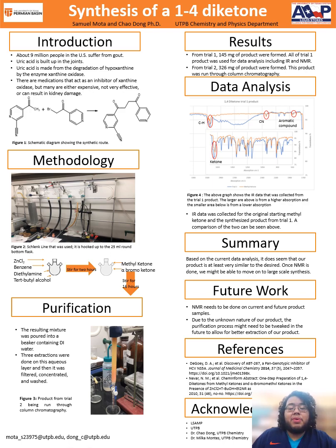In order to continue, we need to collect more NMR data on what we have and what we get in the future. We should also perfect our purification process.